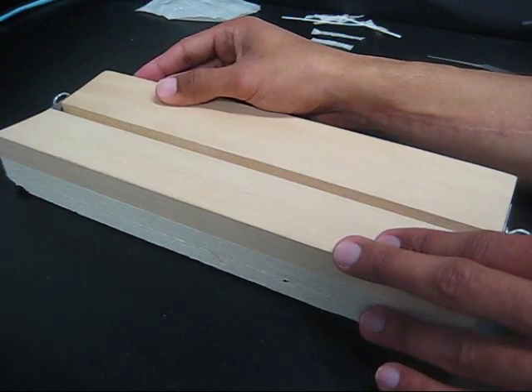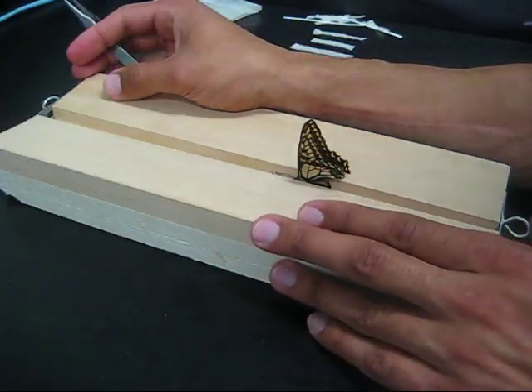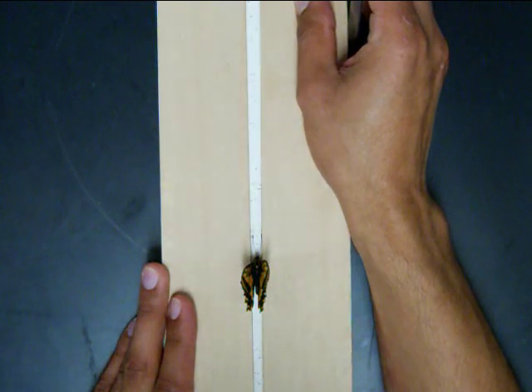Loosen and adjust the spreading board. Position the insect in the center furrow. Readjust the sides to clasp the insect.